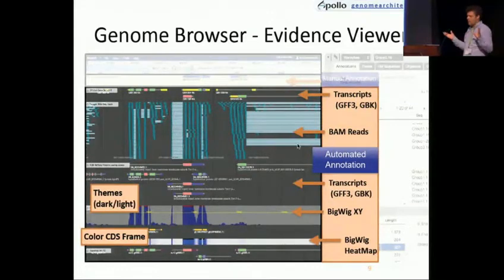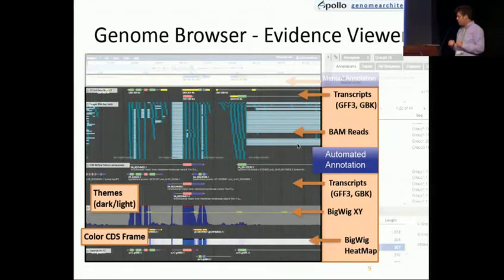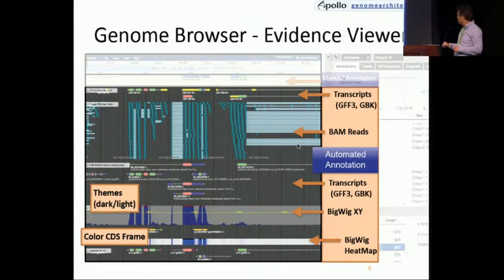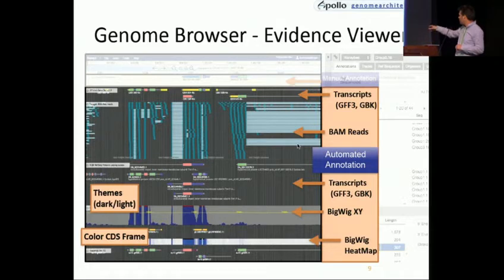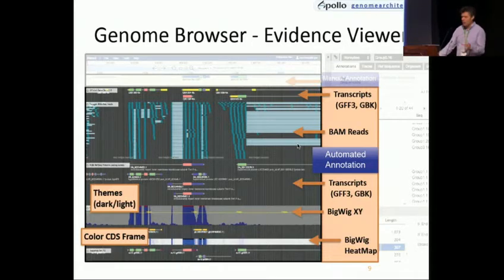I like to think about this in three parts, or the Apollo stack. First is the evidence. When you create your automated annotations or collect other data, it comes into the evidence section at the bottom. Here we have some examples of transcripts, BAM reads, and bigwig files displayed. There are a couple of different themes — here I'm showing the dark theme. We can color the CDS frames. This is what you use to basically collect and review the data.